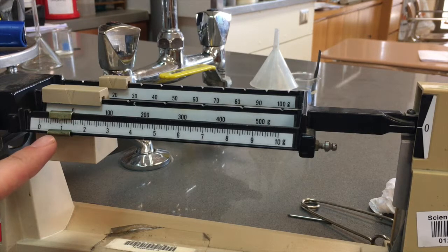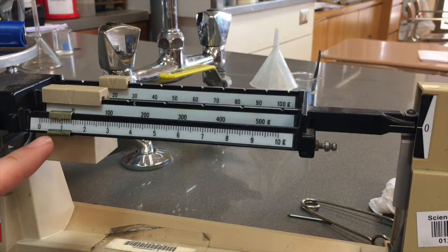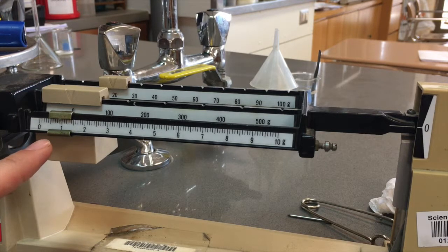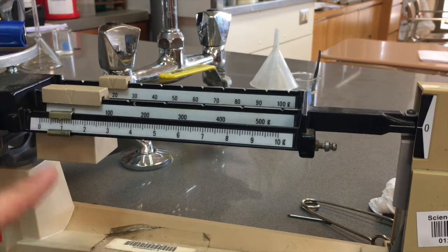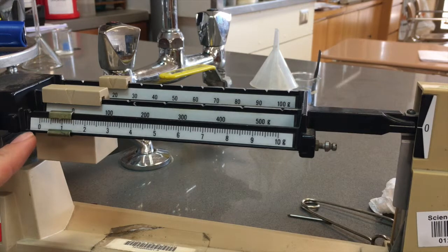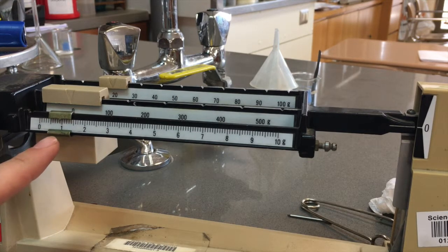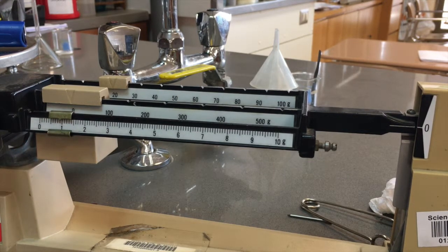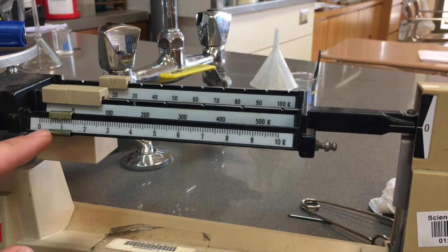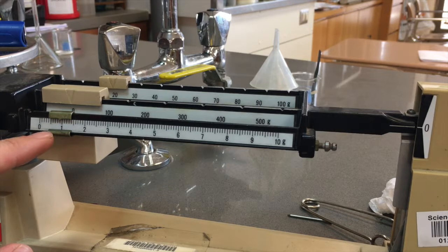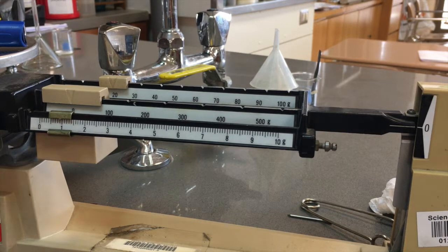So we've got 20, and then we've got something between 0.9 and 1. So I'm going to say 20.9, and then I'm going to guess 7 there.